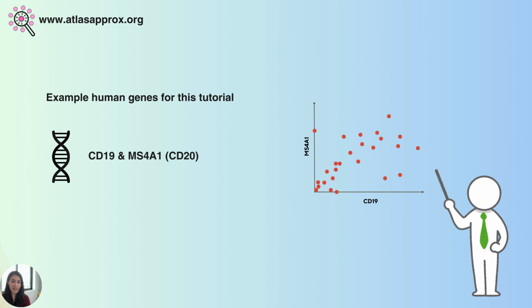As an example today, we will focus on two human genes, CD19 and MS4A1, also known as CD20. These are well-known markers for B cells, and their co-expression is crucial in immunology and cancer research, which makes them important genes to study together.